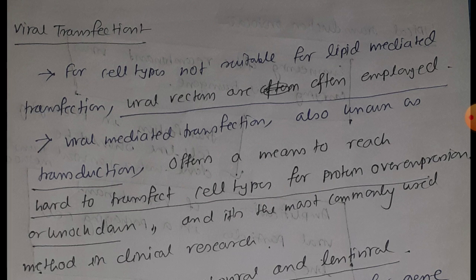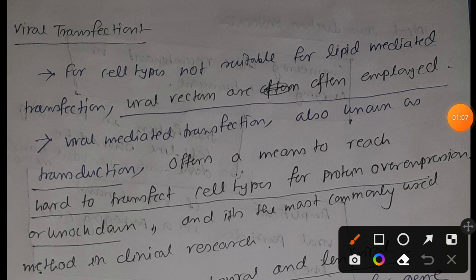You have to learn about the basic transfection or transformation procedure first, then it will be easy to understand viral transfection. And if you have knowledge about other gene transfection methods, then let's start to learn about viral transfection.